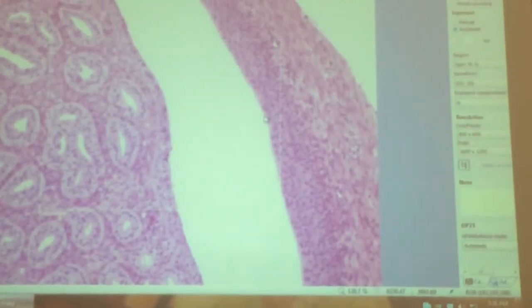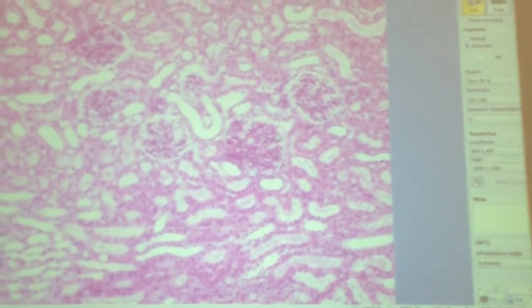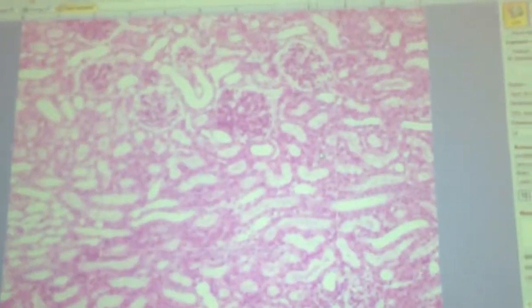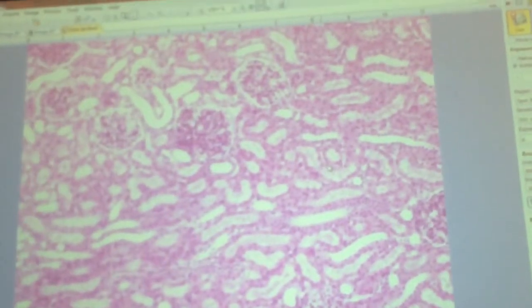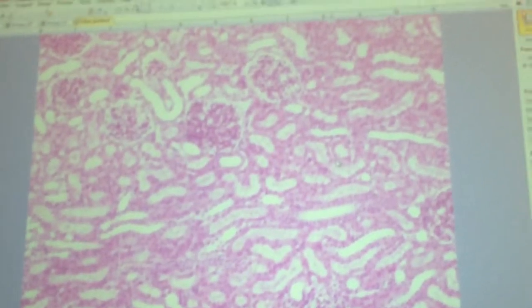Okay? All right. Let's see. I'm going backwards, so I hope that didn't make you too sick. Okay, we're going to look back here in the cortex for a moment. And I'm going to see, oh, this one's fantastic. Let's just talk about this one right here. And I forget you guys don't have a pointer in your field of view. Let's do this.